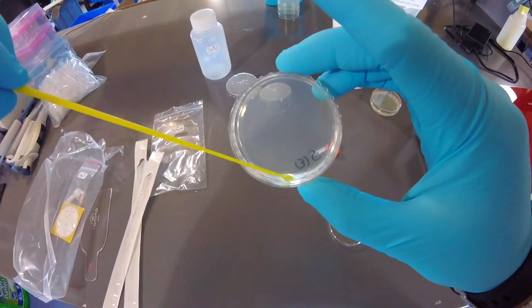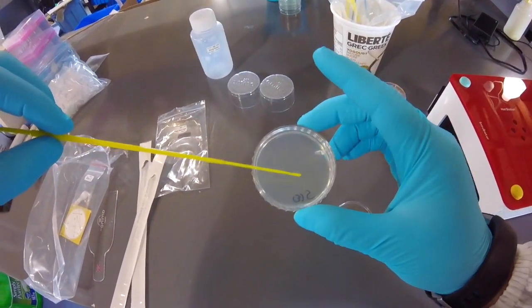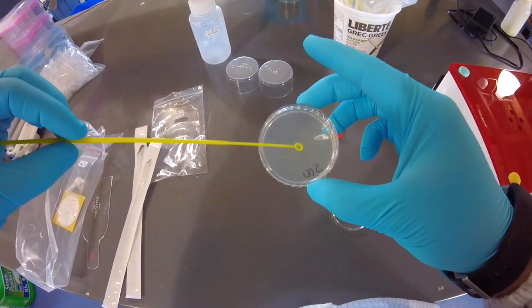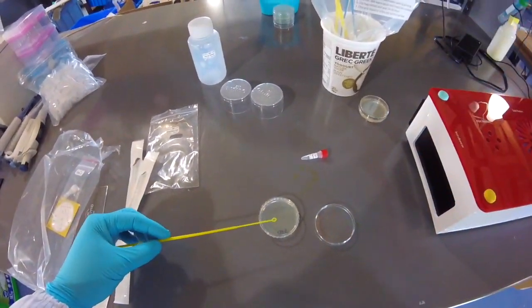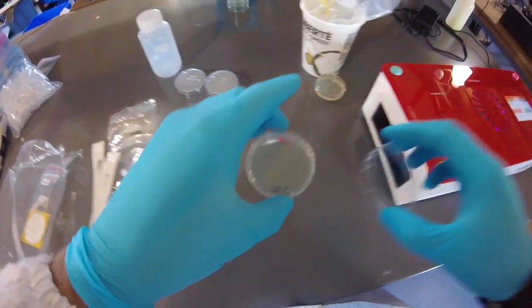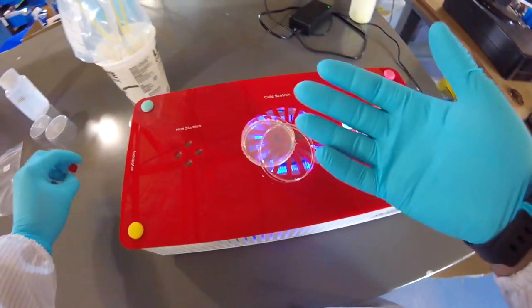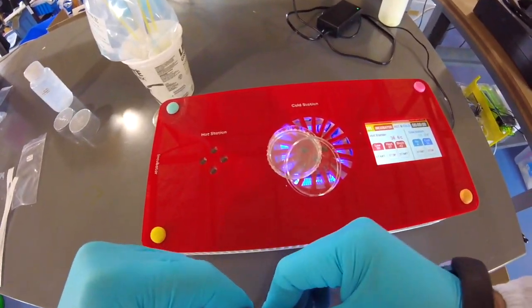And you can see that there's definitely liquid in there, right? And so that's what we need to allow to evaporate now. So I'm just going to put my loop into the inactivation bag. I'm going to put this back on the cold station here like so, and let the air blow over it and evaporate that liquid, and then the cells are going to be adhered to the surface of the agar.